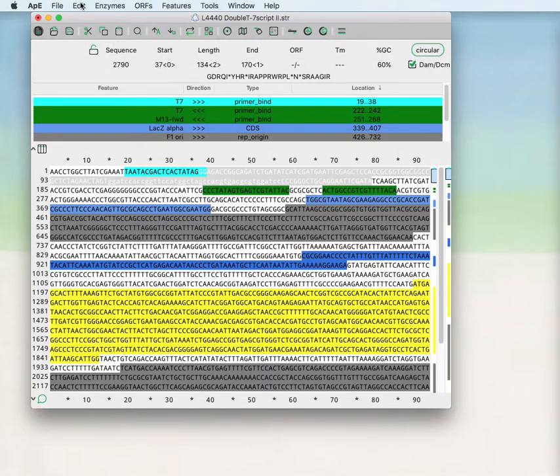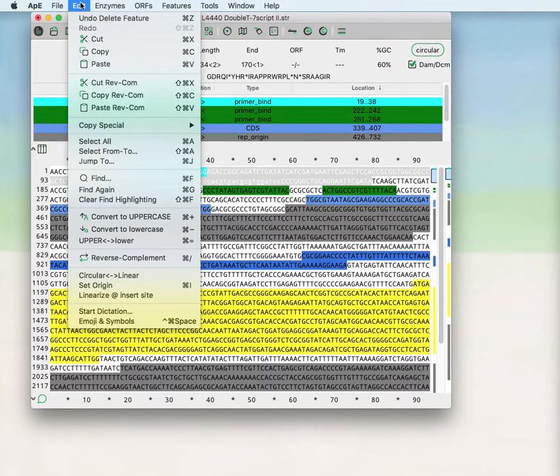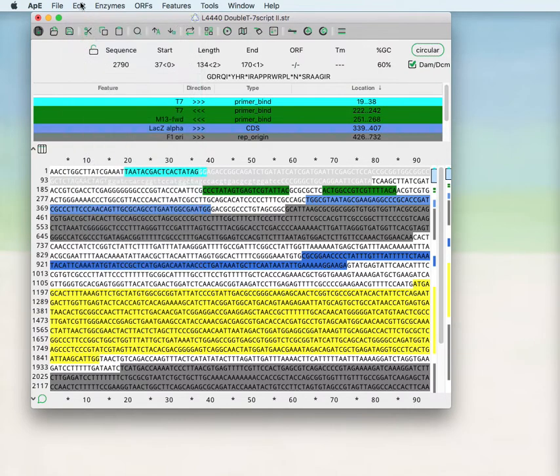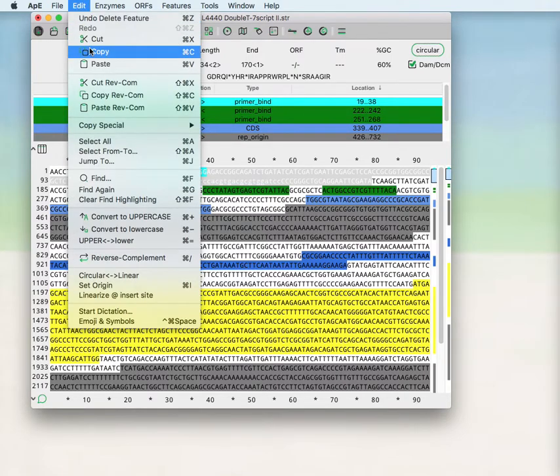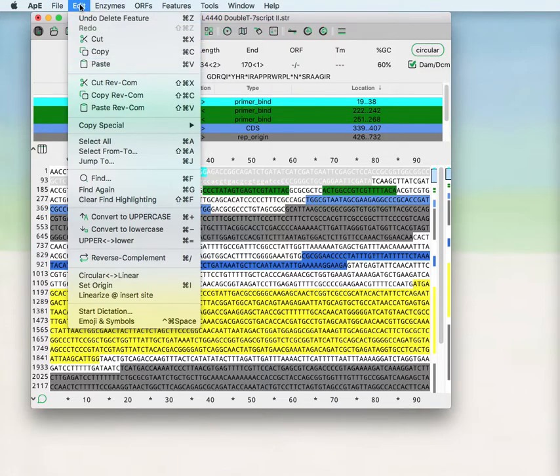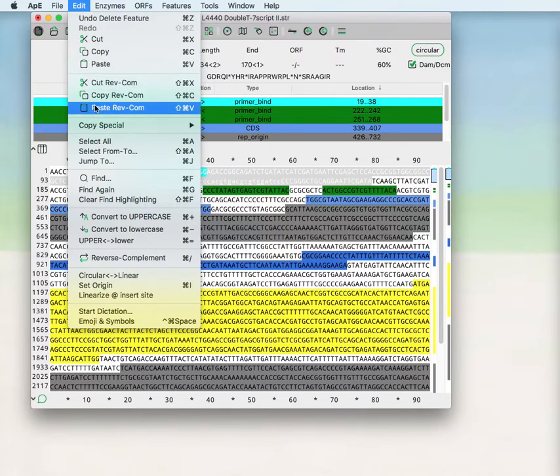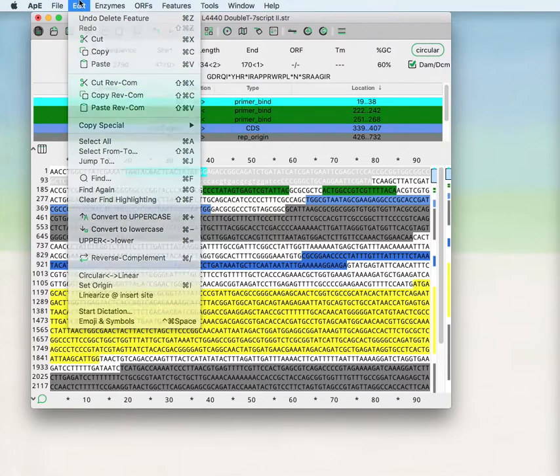Next is the edit menu. The edit menu can primarily do the functions of cut, copy, and paste. You can also cut, copy, and paste the reverse complement.